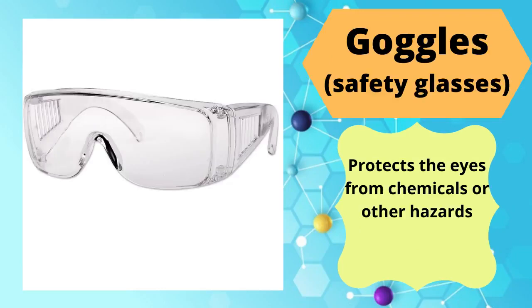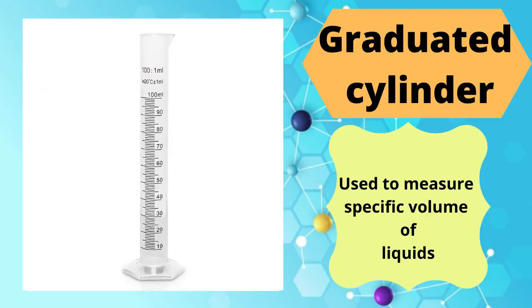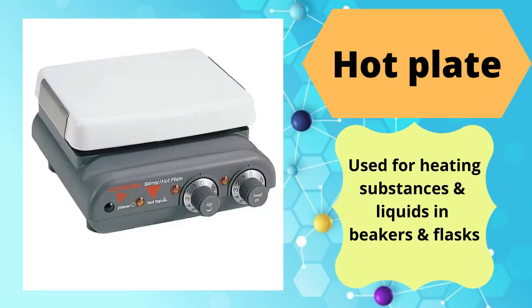Goggles, also known as safety glasses. It protects the eyes from chemicals or other hazards. Graduated cylinder, used to measure specific volume of liquids. Hot plate, used for heating substances and liquids in beakers and flasks.